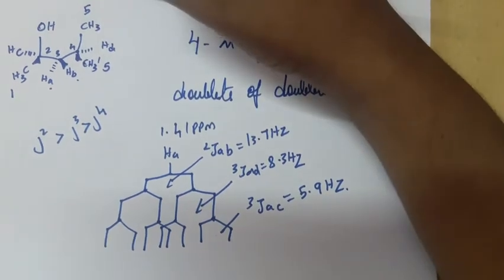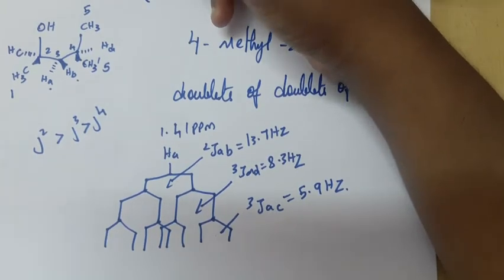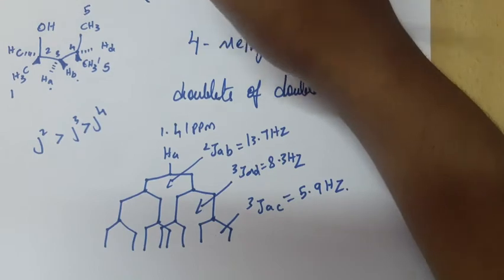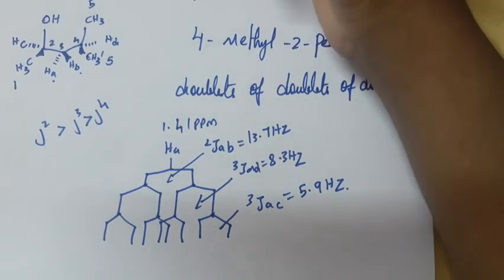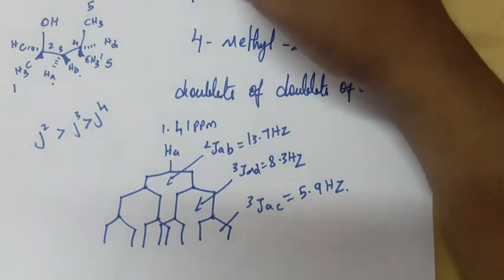Look, NMR arises because of magnetic spin, the spin of the nucleus, and we apply a magnetic field, and it's going to precess. The spin of the nucleus, of nuclei containing odd nucleons, can be up or down.